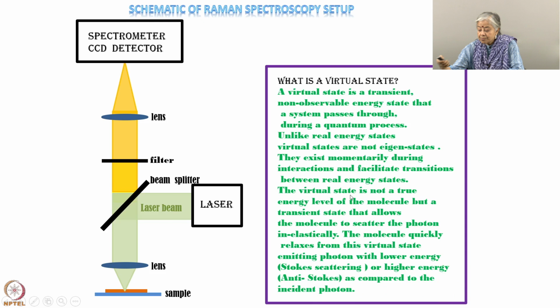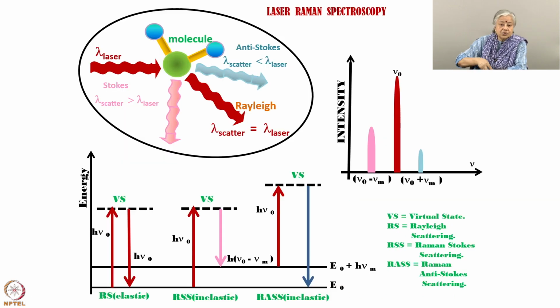Okay. So, basically, suppose I were not using a red laser, suppose I was using some other wavelength, it could have been a green laser, okay. Visible. Many of these experiments are done with visible lasers, though the energy levels to be studied are vibrational levels, those will be in the infrared.